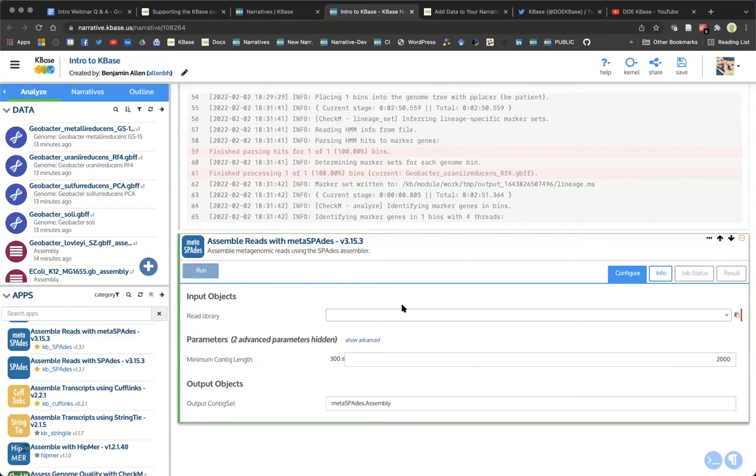For a complex soil metagenome, it will take a couple of days to run, but you get access to this compute, and it's a lot faster to do it, and you don't have to sacrifice your own computing power to do these kind of big jobs.